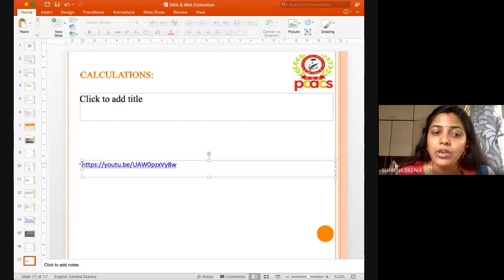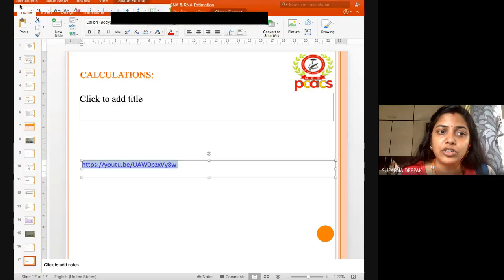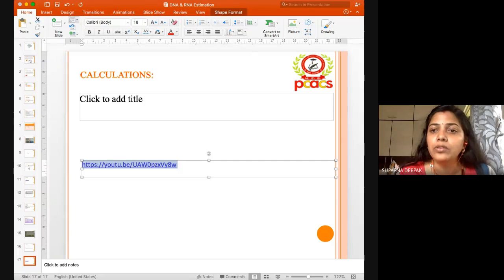I have one YouTube video to show you how to do this estimation part. I have not shot this video myself, because it is going to be the same as DNA by DPA. I have not shot that experiment, but it is available on YouTube, and that is what I am going to show you over here. Just give me 1 second.